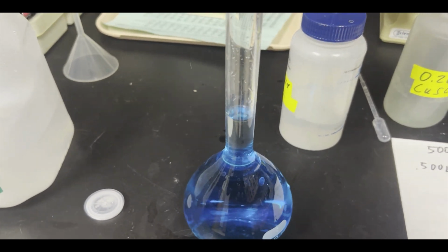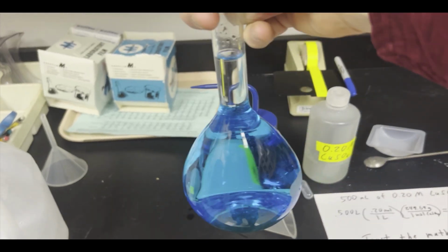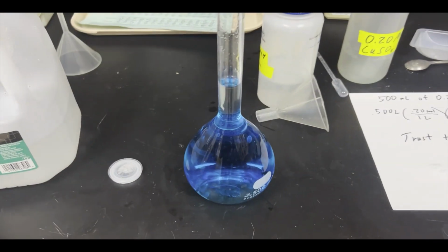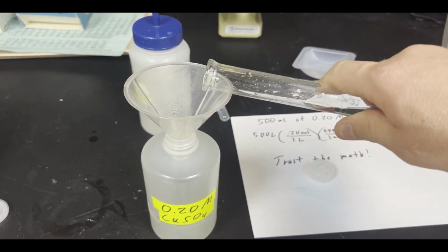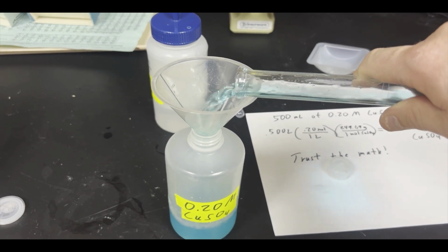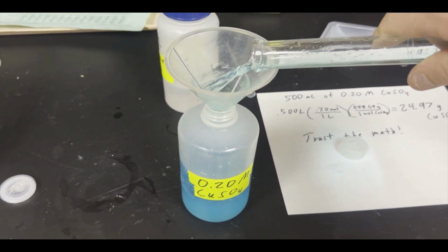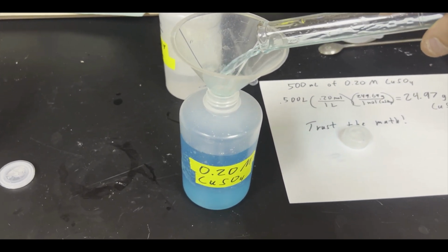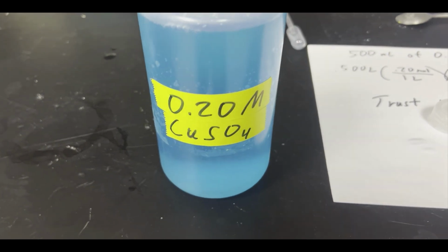Now, last but not least, we do want to give it one more quick swirl, so that all of the stuff in the neck gets mixed in with the stuff in the bulb. And then, because I don't want to store it in this, I'm going to put it back in my stock bottle, which also will do some final mixing for me. So we'll just pour that in. And I have just created, to the best accuracy and precision I can, 0.20 molar copper sulfate solution.